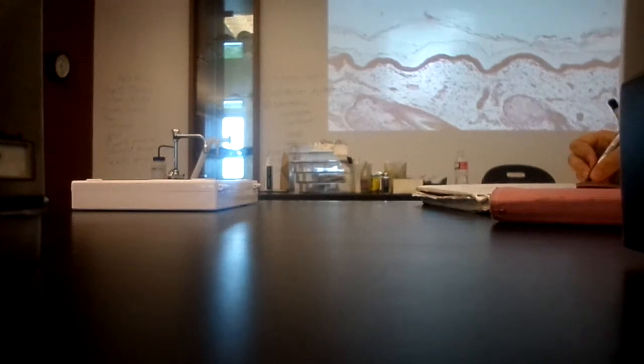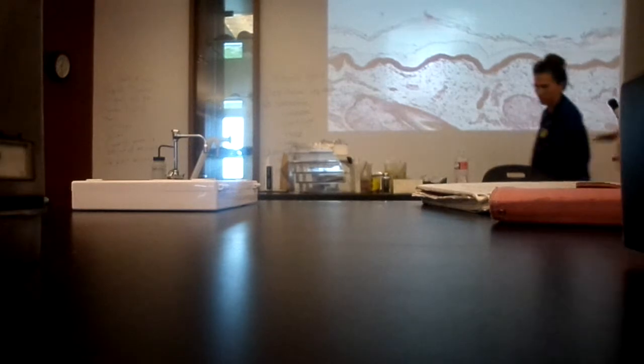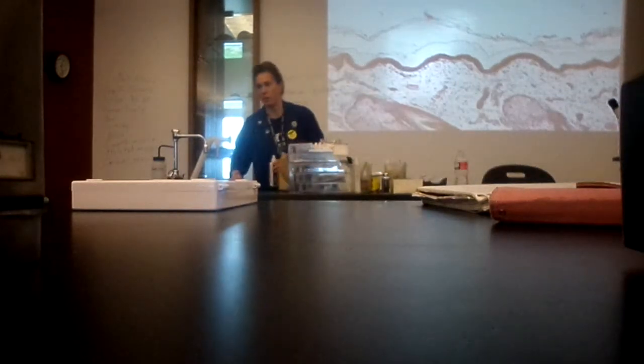So if I were to ask you in general, what do I call the top layer of the skin? Epidermis. If I put the pointer here and said specifically, identify this specific layer, what would it be? The stratum corneum. And if I said the same thing down here, it would be stratum basale. Any questions on that?